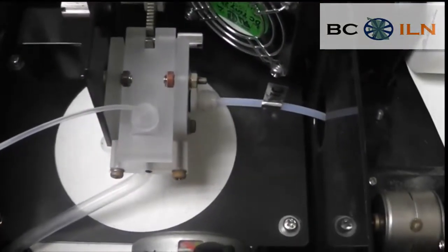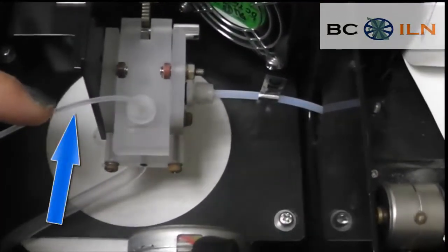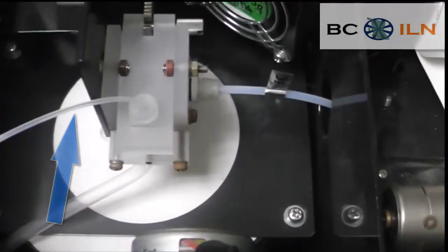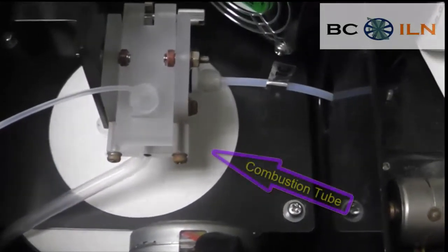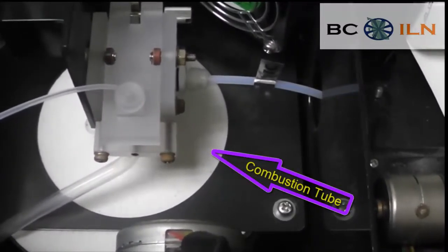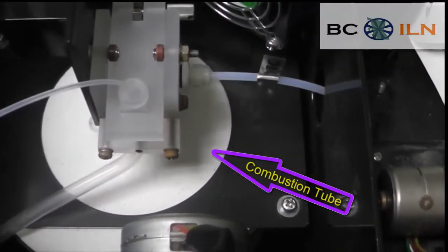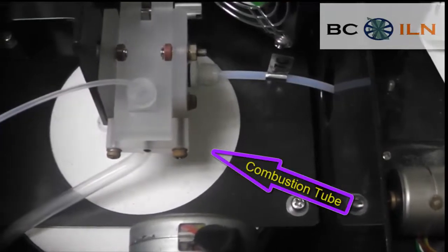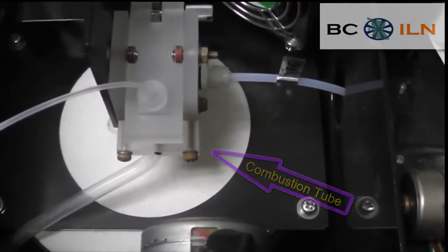The first sample has been drawn up through the needle. It goes through this tube here and goes into the combustion tube, where the temperature is at 720 degrees Celsius. This extremely high temperature decomposes the total nitrogen in the sample to nitric oxide.